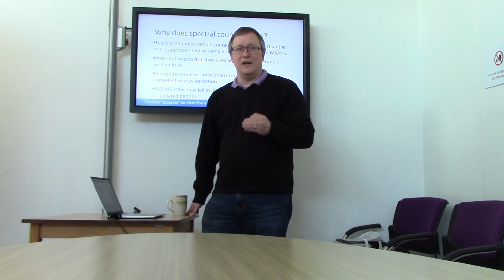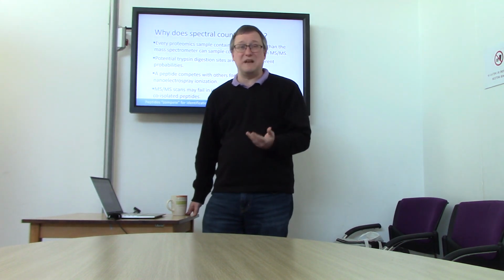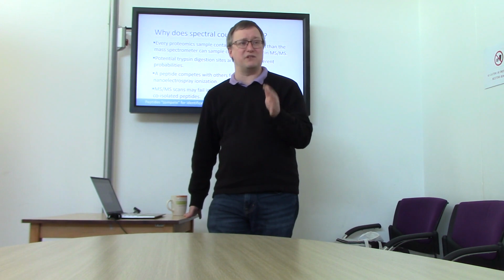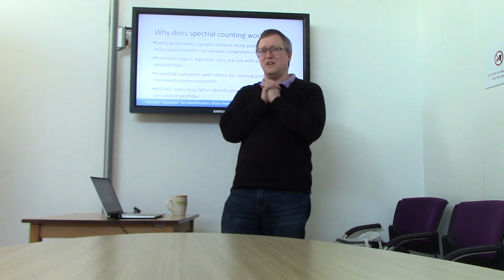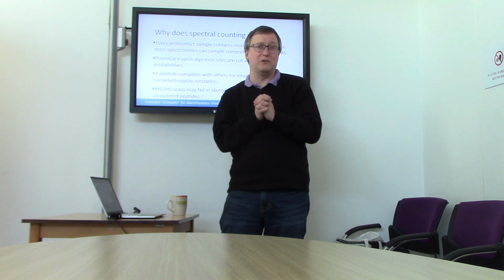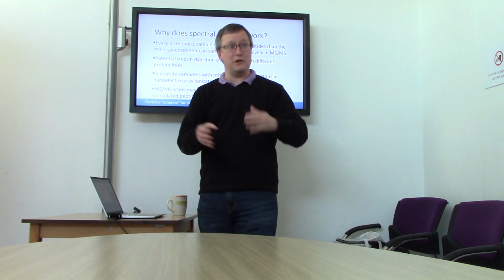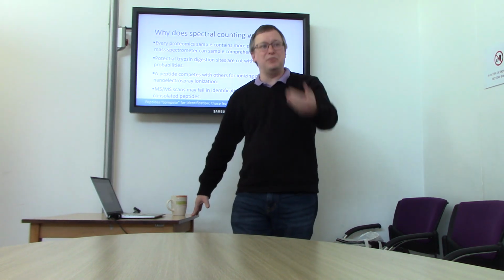The mass spectrometer has limited attention available. It can generate, let's say, 10 tandem mass spectra every second. That's really fast compared to the stuff that happened when I was in grad school. But you can capture 10 tandem mass spectra in a second with, say, a contemporary Orbitrap instrument. So the instrument is trying to select, for fragmentation, those ions that are most promising, which is to say they have the greatest intensity, suggesting there's a lot of them there, and it's an ion that isn't at a mass to charge value that was recently sampled. Okay? So that creates a sampling process.